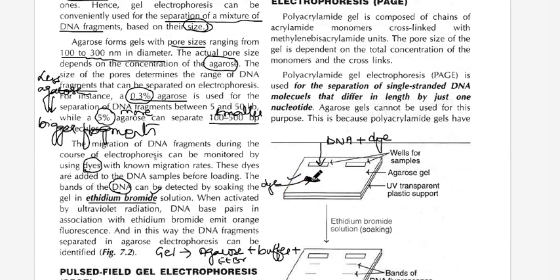but to see the DNA in the dye, we have to put ETBr in the gel, at the time of pouring the gel into the caster. So ETBr is what? When activated by UV light. So when the band has traveled through the gel, we visualize it in the UV transilluminator.